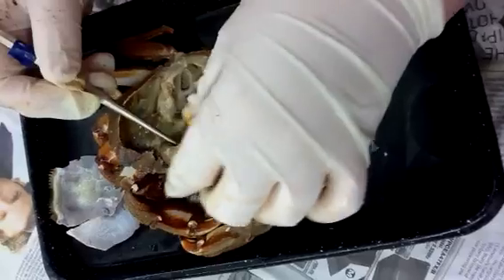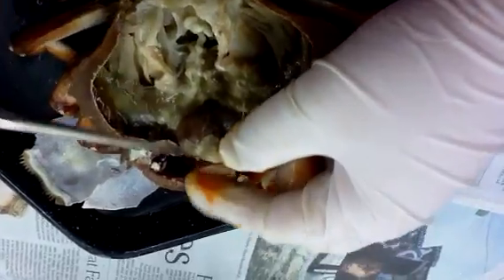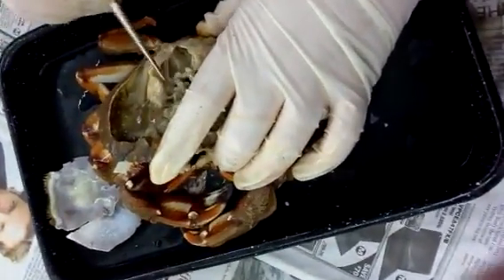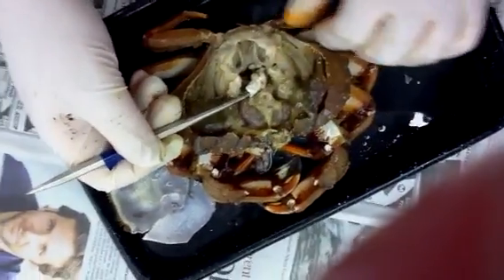Underneath the digestive gland is the cardiac portion of the stomach, which is going to be in this area right here. And then right at the base here, this white structure is the heart.